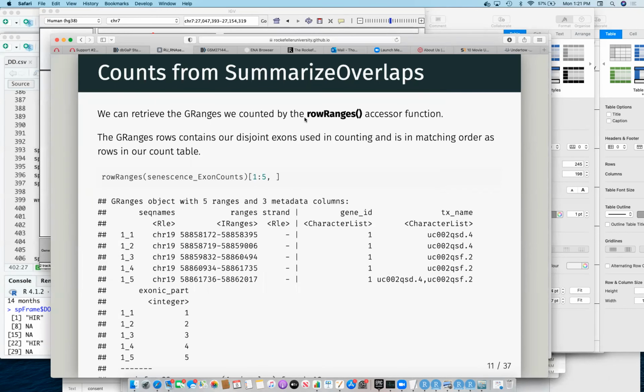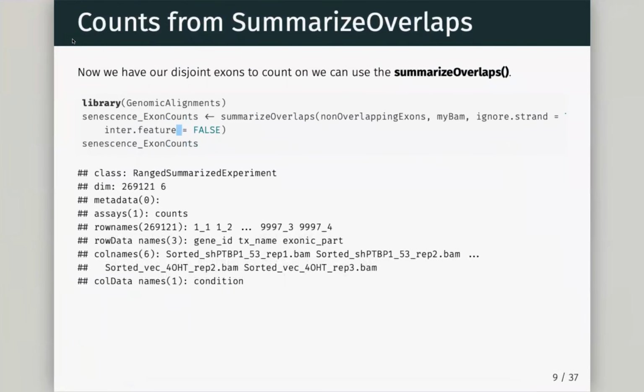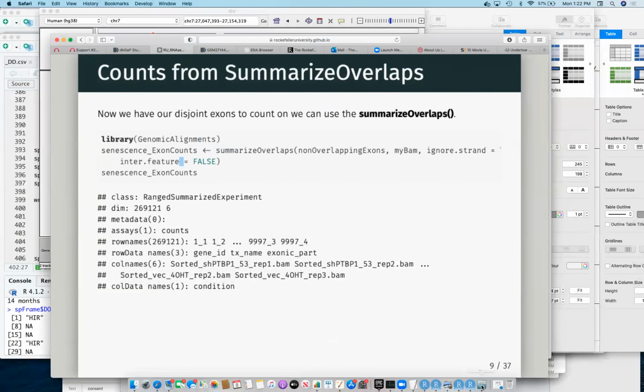Another time you'll do interfeature equals false is when you do things like, and you're going to see this in single cell, but you see it a lot from places like the Heintz lab here, Adam's lab. Anyone working on neurons, what you tend to do is extract the nucleus, and you will do nuclear RNA-seq, effectively use an antibody for the nucleus to get a particular cell type. That is unspliced, right? Which is a big problem because often genes overlap each other.